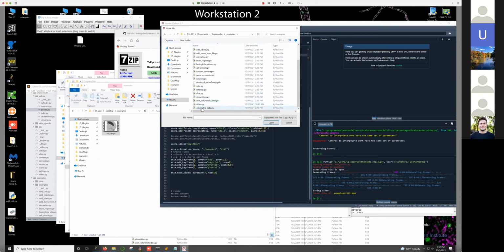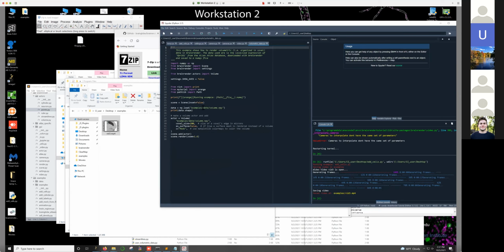right down the bottom, volumetric data. And this actually lets you plot TIFF files. This is mainly for the BrainJ pipeline, where you've actually rendered projections in the Atlas space. But if you're working with a different pipeline that also transforms data into the Atlas space, then you can look at them inside BrainRender as well.